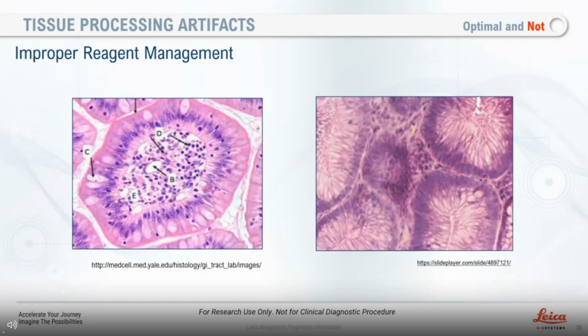We are always getting understained hematoxylin in histopathology staining. We are using Harris hematoxylin followed by bluing, and I think that's supposed to be destaining. Can any steps of tissue processing result in this problem, though eosin staining and tissue morphology are fine?